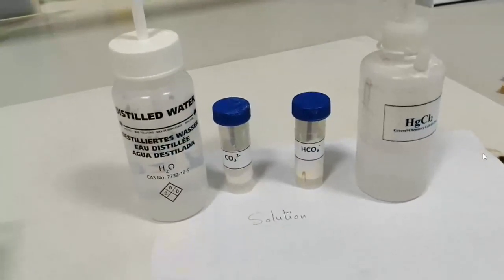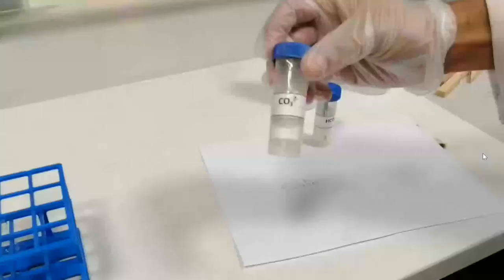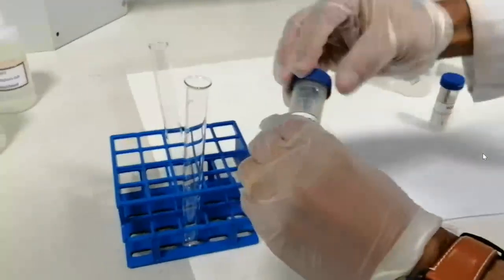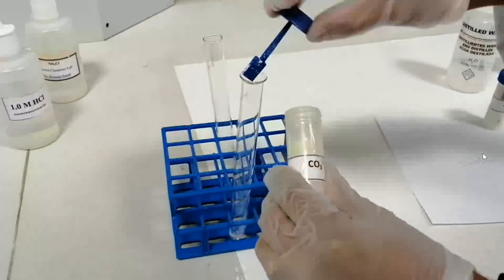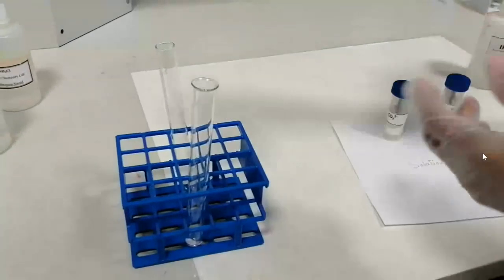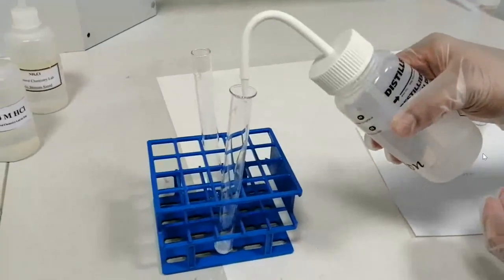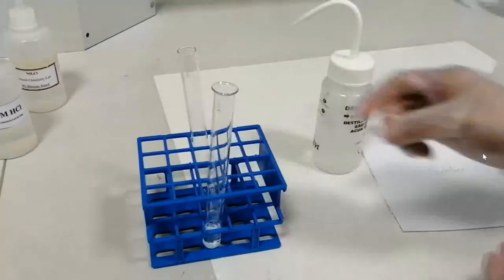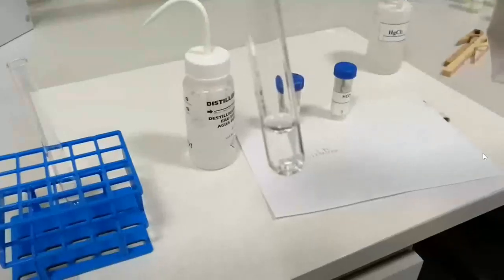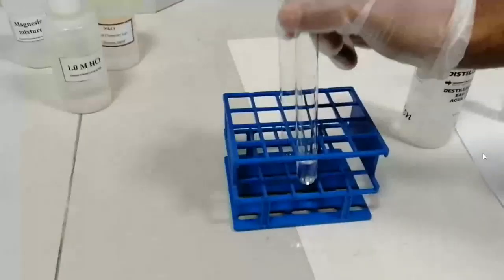You have to prepare a solution. How can we prepare a solution? In a dry test tube, take a few crystals of the salt you have, in this case carbonate, and then add a few milliliters of distilled water, just distilled or deionized water. Add 2 milliliters, and then shake them well in order to have a clear solution. You can see the clear solution, which means the salt is dissolved in the water.